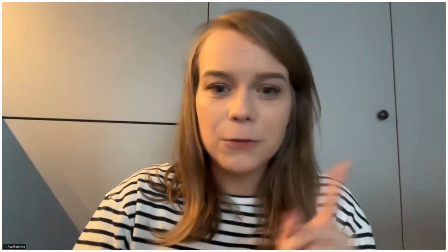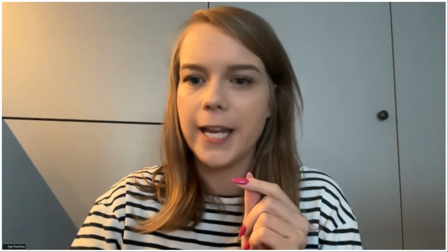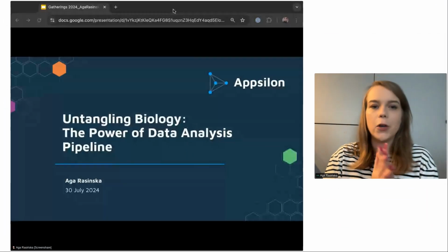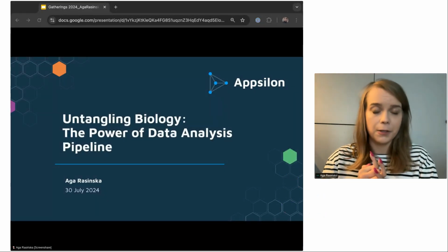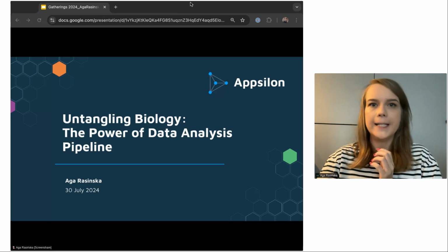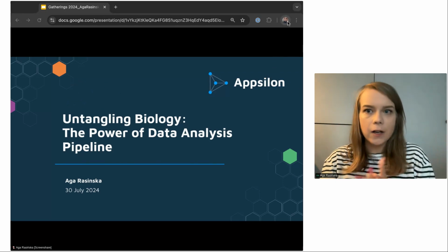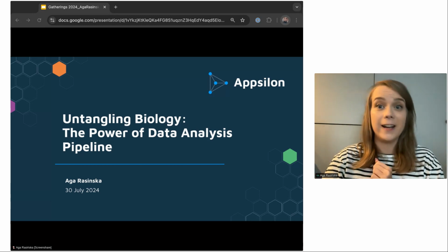And today I'm going to take you on a journey. I'll just share my screen so you can have a taste of what we'll be going into today. We will be talking about a data analysis pipeline using one real case scenario: single cell. So let's get started and let's see what's possible in life science.